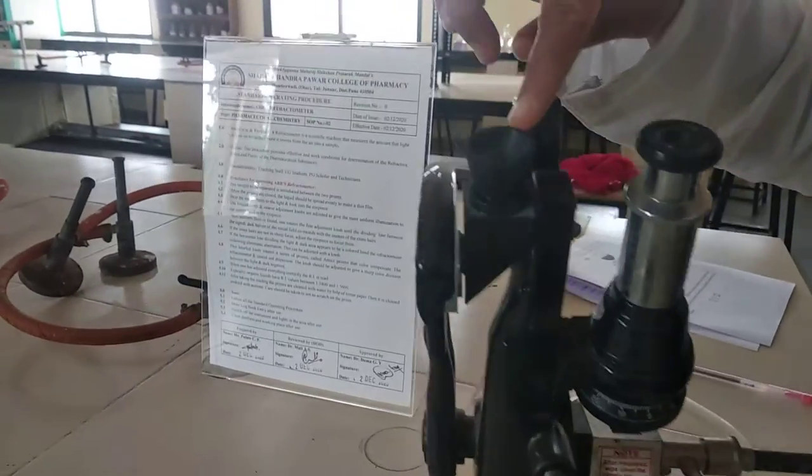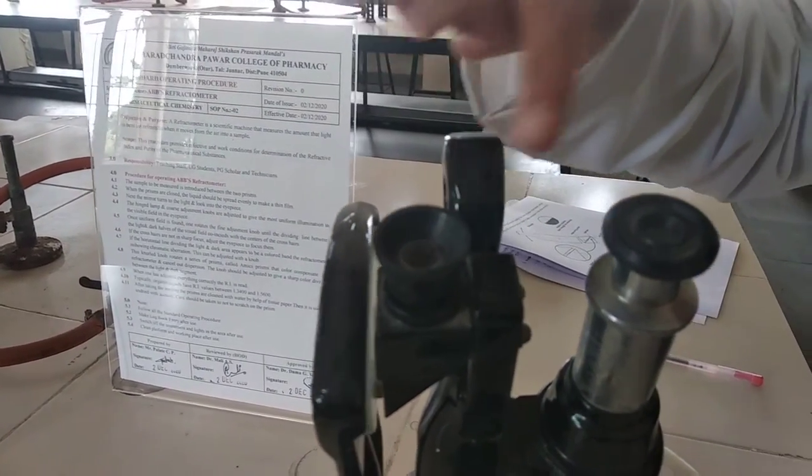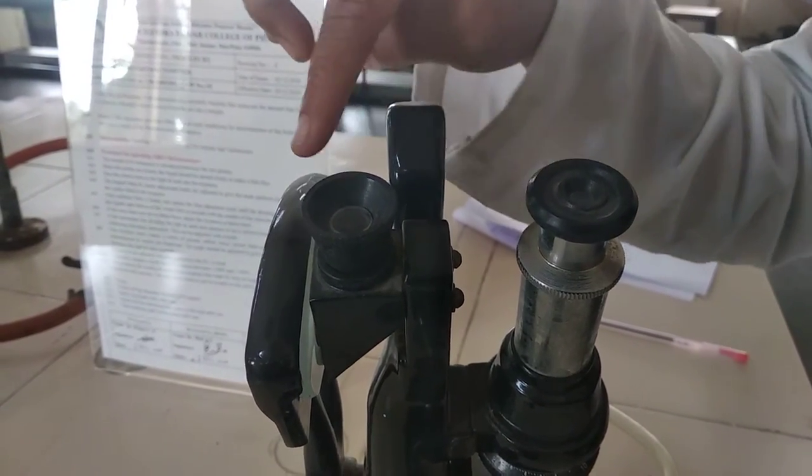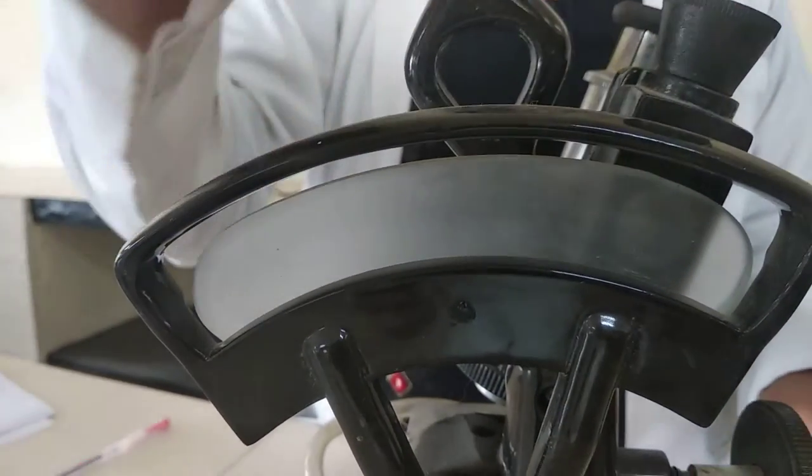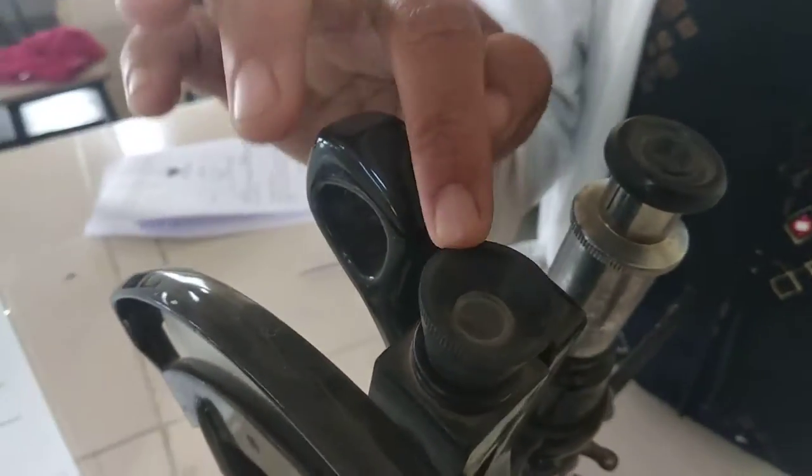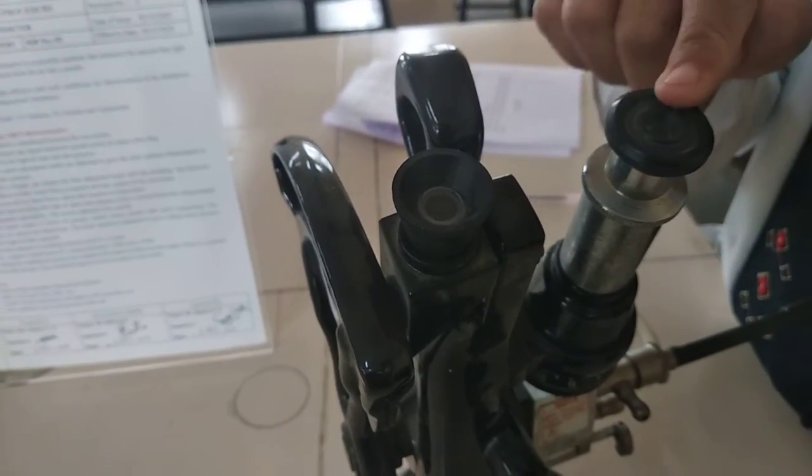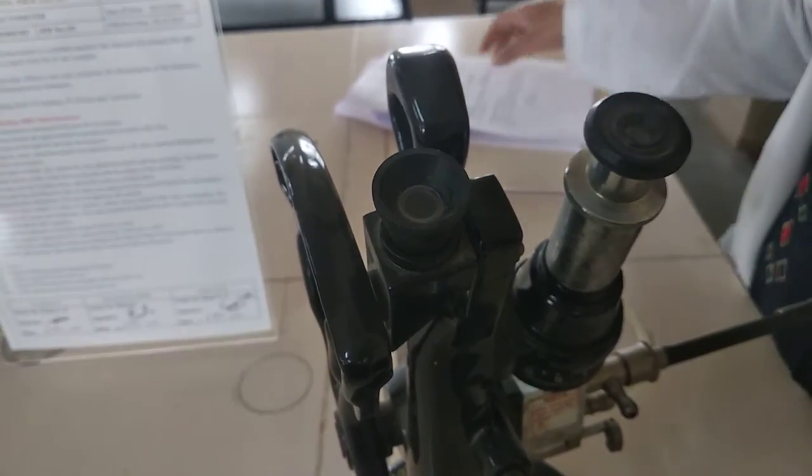Afterwards, it contains two eyepieces, first and second. This eyepiece, one is attached with a measuring scale. Just see the measuring scale. This eyepiece is used to observe the measuring scale. And the first one, this eyepiece, it is used to observe the dark and light mark.